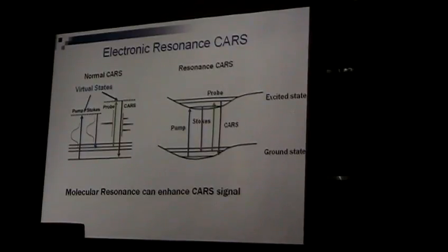It's called resonance Raman. In resonance Raman, you can get something like 1,000,000 times more signal. The problem here is with resonance Raman, that means, basically, doing CARS for Raman with a fluorescence dye. But in the Raman case, fluorescence increased so much that this actually cancels out, so you don't gain that much. But here, we are looking at the blue side, so we don't have the problem.